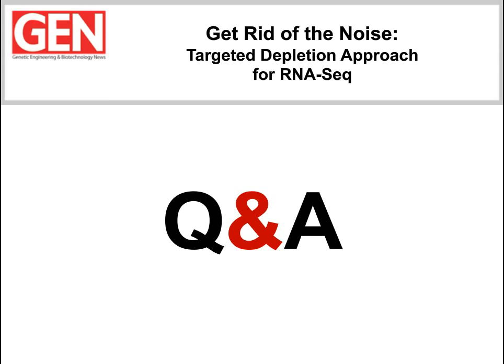Great. Thanks very much, Maureen. Ashish, we have a question for you. A two-part question. What is the minimum input required, and can I use degraded samples?